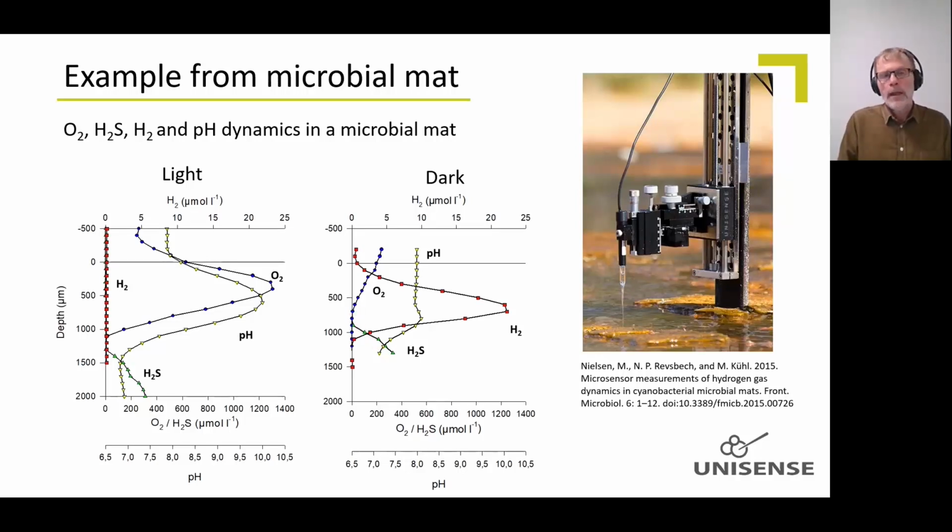This is a type of measurement that's easy to do when you're out there, because you have in situ temperature and light conditions and so on, water running across the surface of the biofilm and all that. It would be more difficult to recreate in the lab.